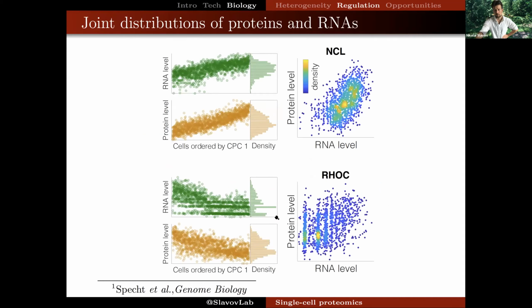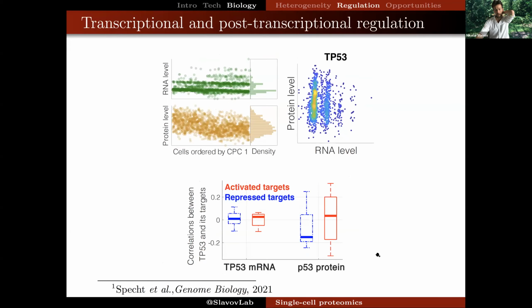And then if we look at a less abundant protein that again shows similar behavior at RNA and protein level, again you can see the correlated joint distribution, but you begin to see some of the discreteness at the RNA level due to having counted a few messenger RNAs, as opposed to the more continuous abundances measured by mass spectrometry of the more abundant protein.